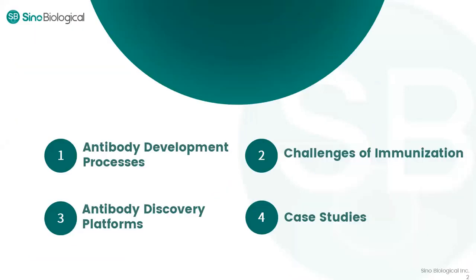So today's talk will be divided into four major parts. First, we will briefly review the processes of antibody development. As immunization is the first step of antibody development, we'll talk more about the challenges and the solutions of immunization. Then we will move to talk about the antibody discovery platforms. And for the last part, we will share our results and data for some antibody discovery experiments.